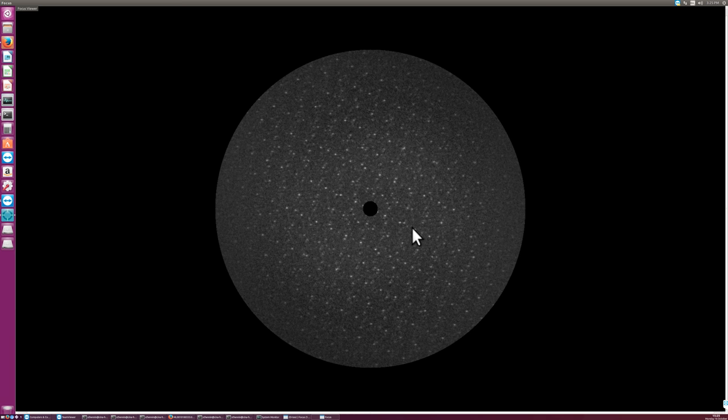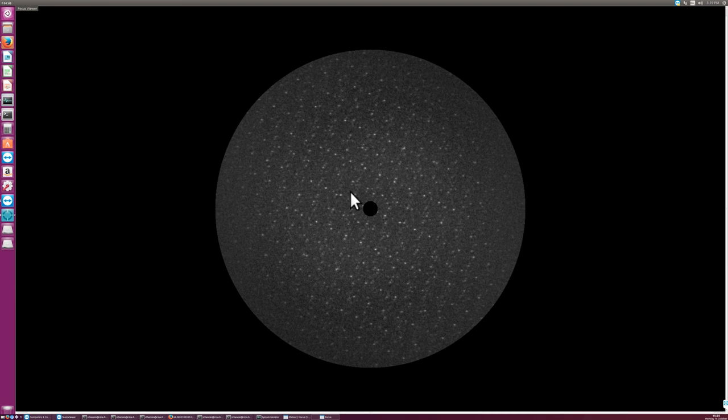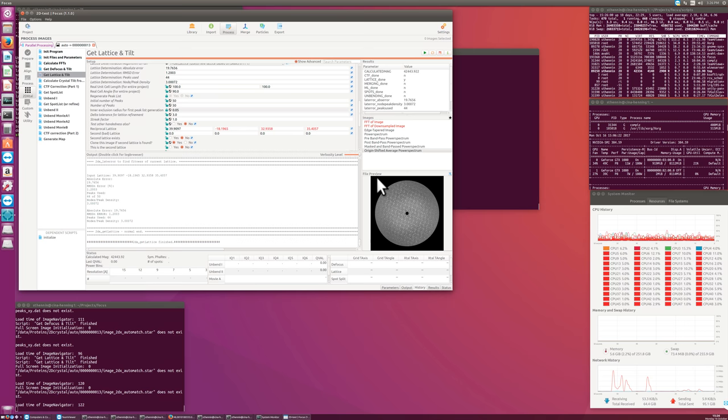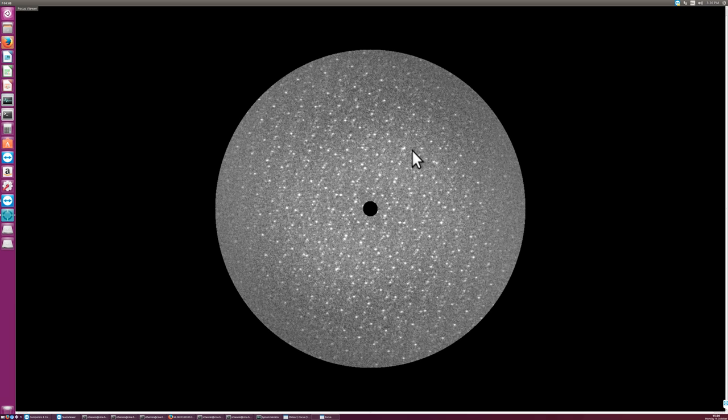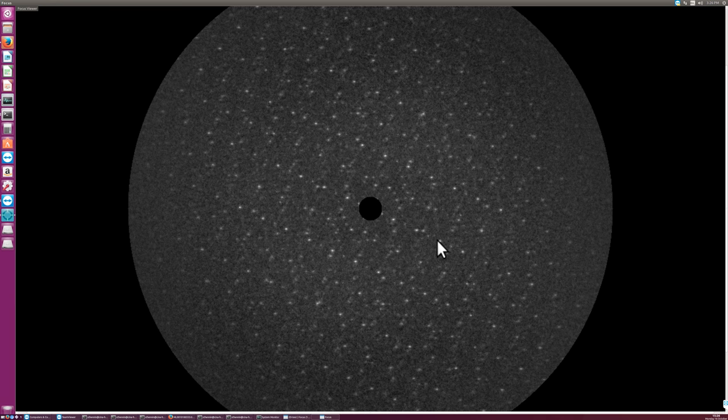And I think this is now the peak P. No, it's also not. I don't know which button this is. But there's another peak list now in this pattern. And these positions of peaks are then used to find a lattice. So we start with a text file of x and y coordinates of peaks plus peak height from this pattern. And this pattern, this origin shifted average power spectrum, should show something that makes sense. So it should show a pattern where one could by hand click on the lattice. And I could do this by hand because I know my protein quite well in the meantime, so I know that probably here's one axis and here's the other axis, and then I can recognize here the first and second and third and fourth spot, and in the other direction there's the first and second, or maybe here, first and second and third and fourth spot.